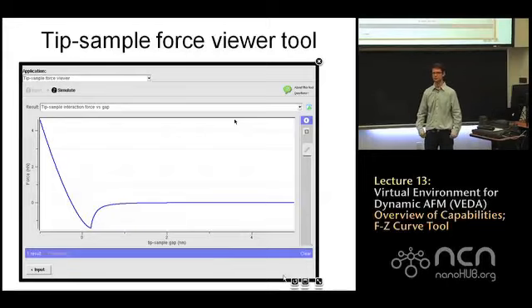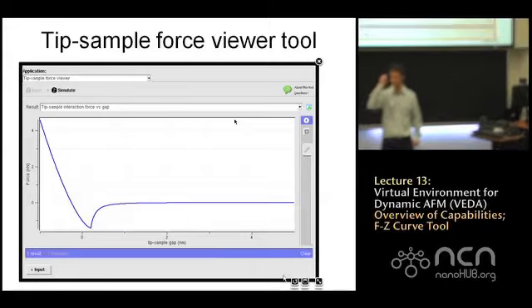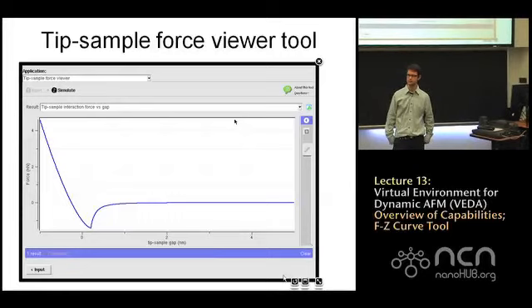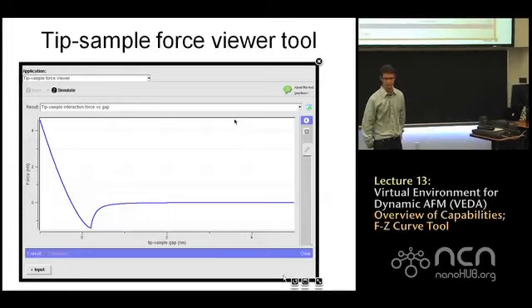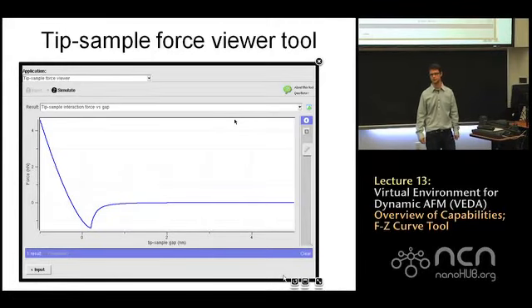This one should be really fast because we're not actually crunching an ODE here. So when I run this thing, I always get these blank screens, and I don't know whether it's computing. Yeah. There it is. Okay. I think maybe it's either the connection or the web browser. There's no little clock that gives you feedback that it's actually doing it. Yeah, there should be a progress bar on the other tools, the ones that are doing more intensive calculations. The force distance curve really should take a second or two.